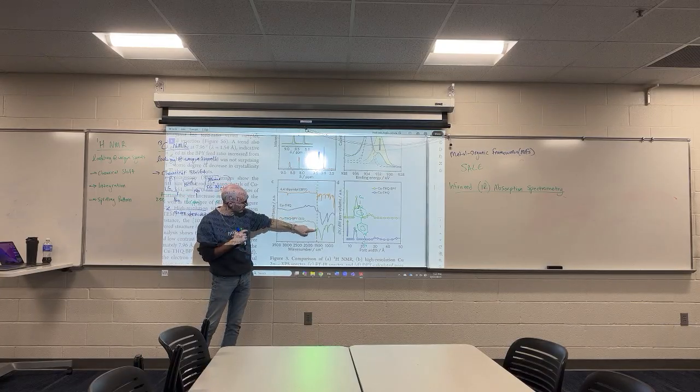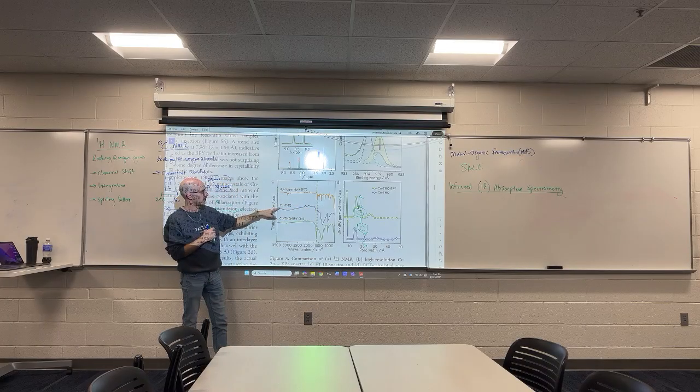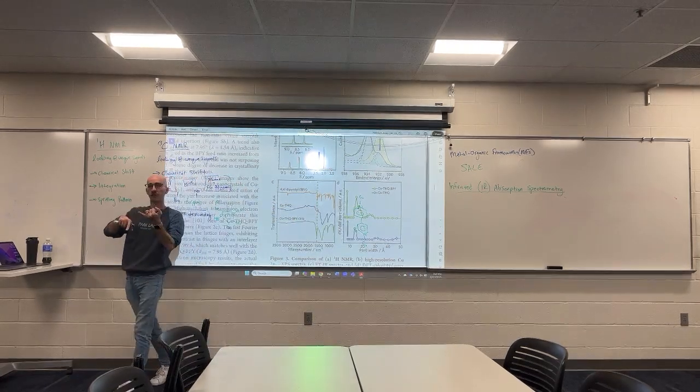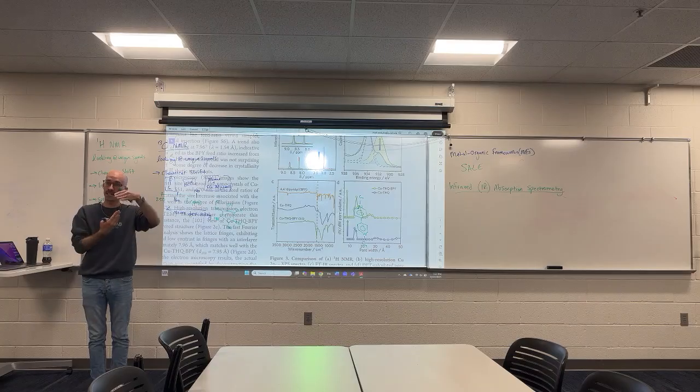And you can see this signal in green is very sharp. There is a similar absorption in blue, that's just the mixture beforehand, but that's not a sharp peak. So by looking at the change in frequency and by the change in intensity, I was able to say with certainty, yes, bipyridine is being coordinated into this material.